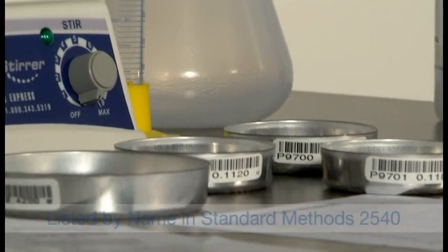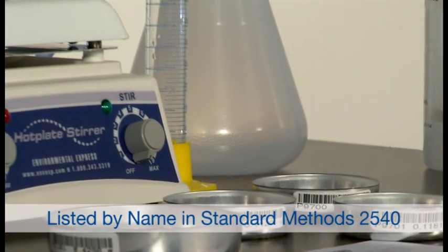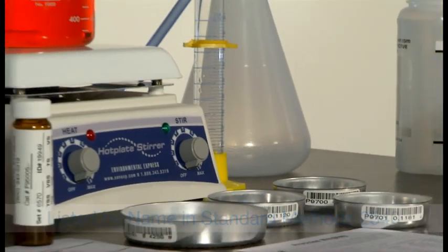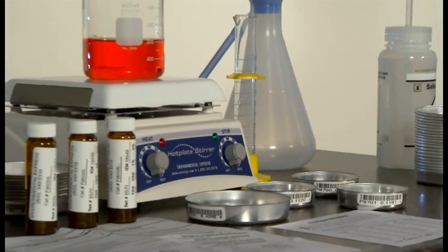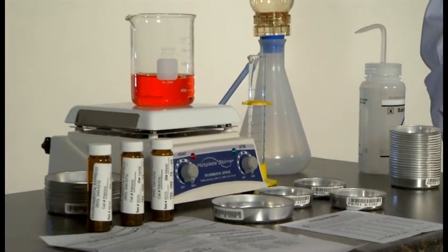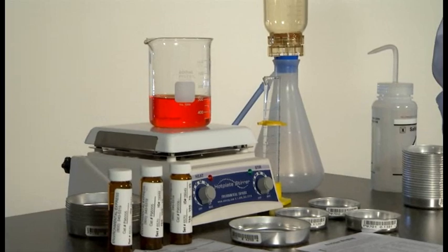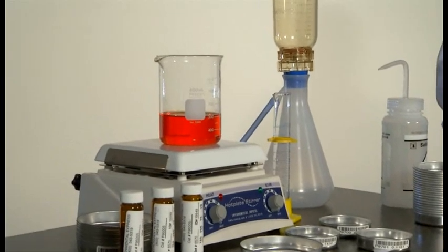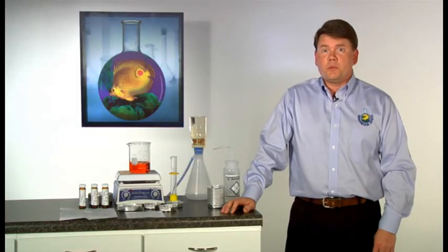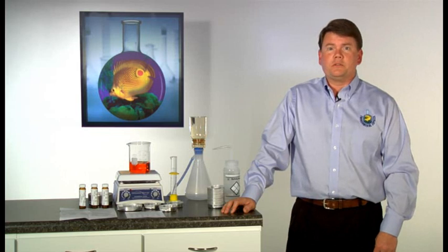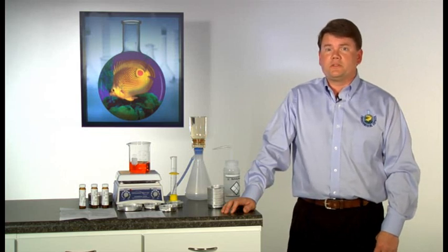ProWeigh filters are designed for use according to standard methods 2540. Each filter is a nominal 1.5 micron binderless glass fiber filter exactly as the method requires. We're unique in that we've performed much of the test by prepping the filter for the analyst before it reaches the laboratory.